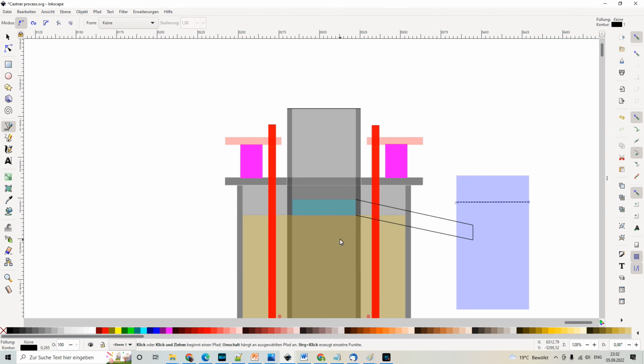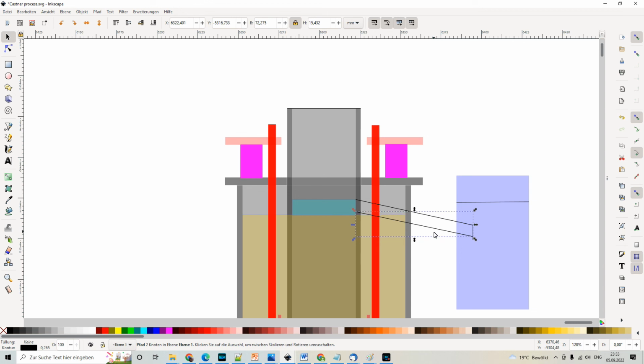So when the sodium hydroxide is getting electrolyzed, sodium is generated, the sodium floats up, and when the sodium is above a certain point, the sodium will start to float into the chamber filled with paraffin oil. I have never tested this. I don't know if it's a good idea or not, but I know that the open cathode chamber has some drawbacks.